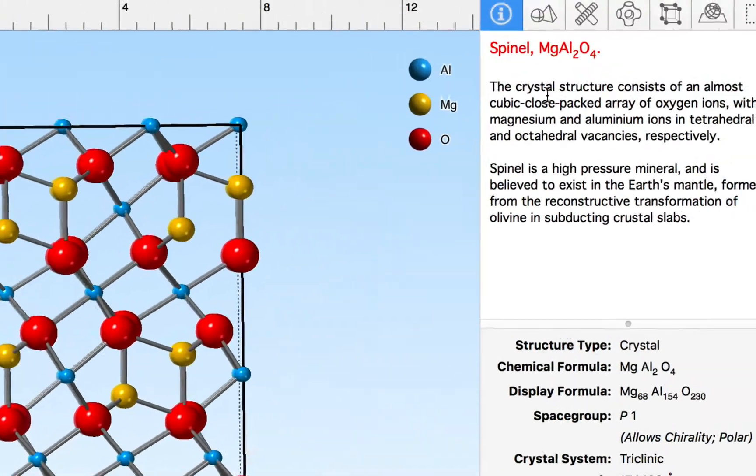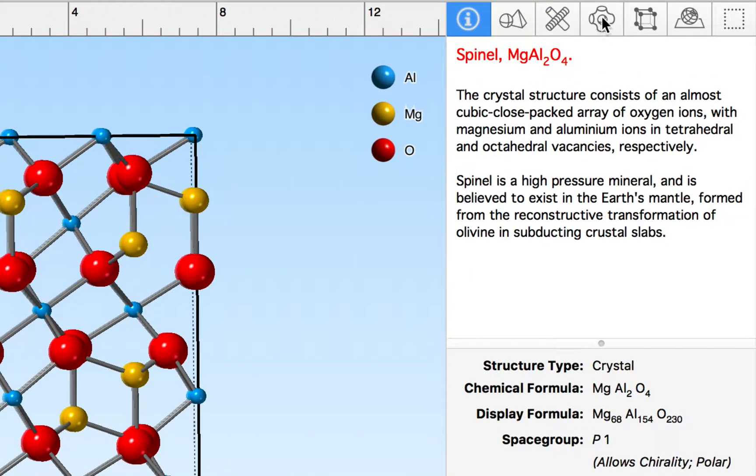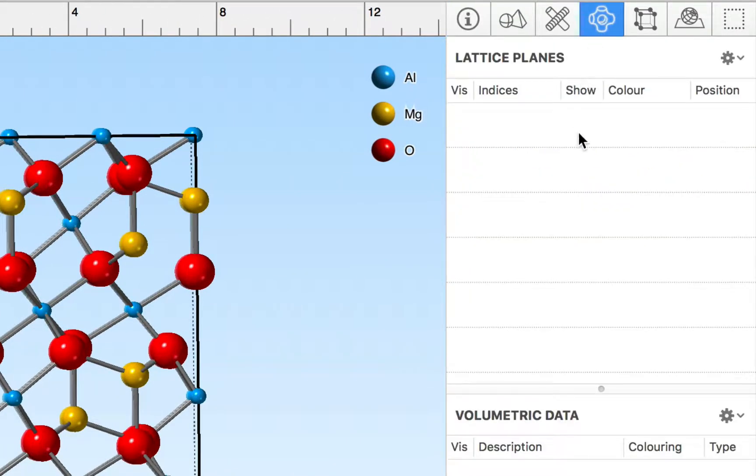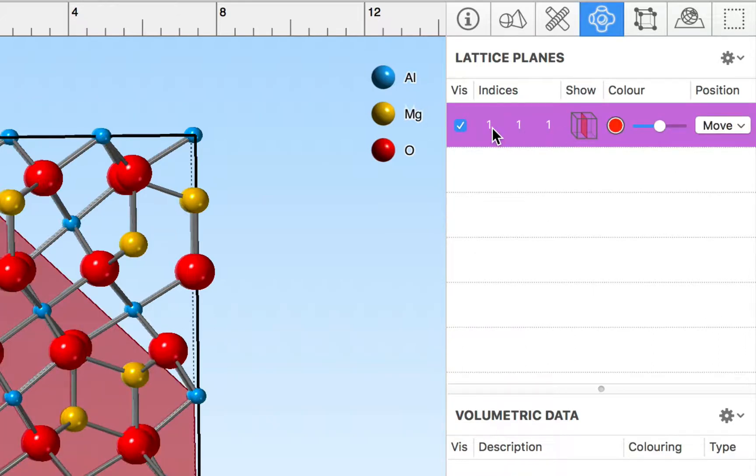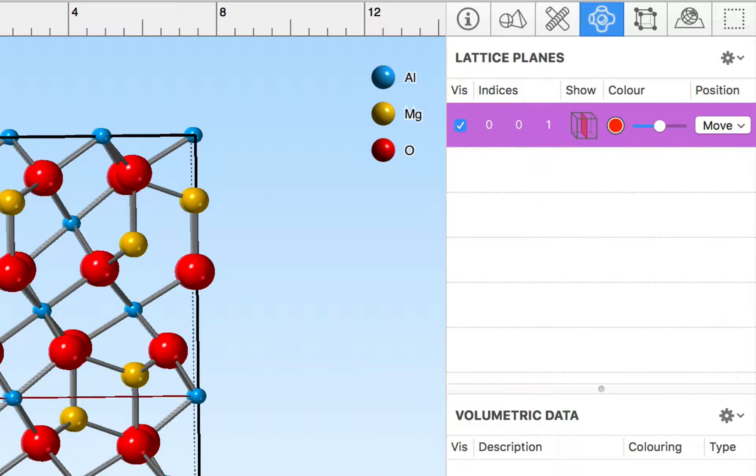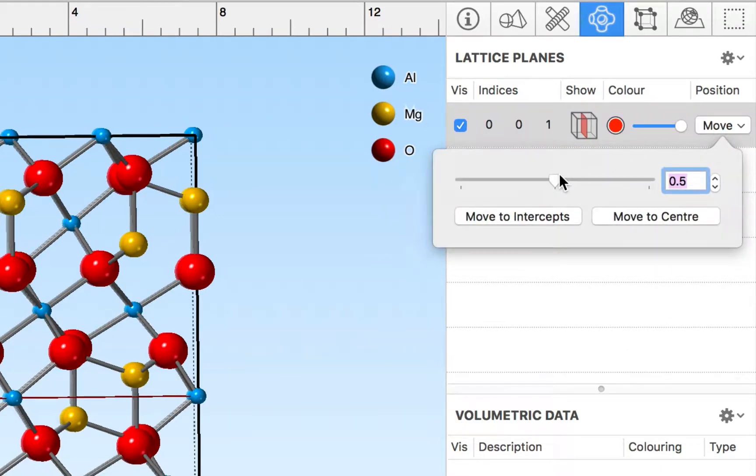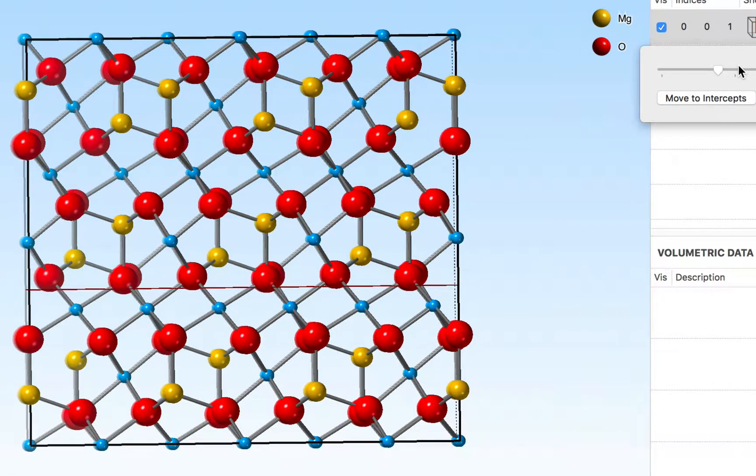I'm going to move over to the inspector on the right to the volume inspector and I'm going to add a new lattice plane and change the indices to 001. This is relative to our new dummy lattice and I'm going to reposition the plane where I want to insert some space into my lattice. So let me just move this down and I'm going to put some space just here. So that's my plane nicely inserted.